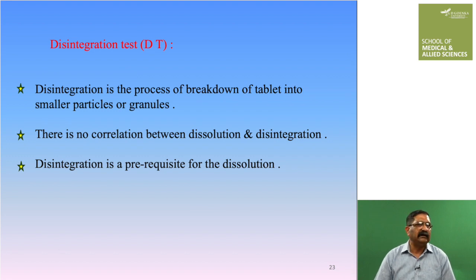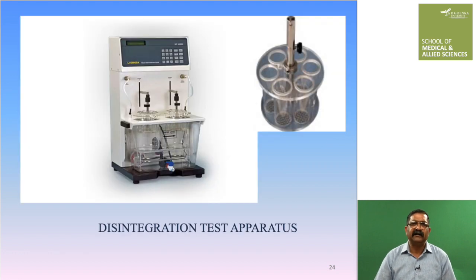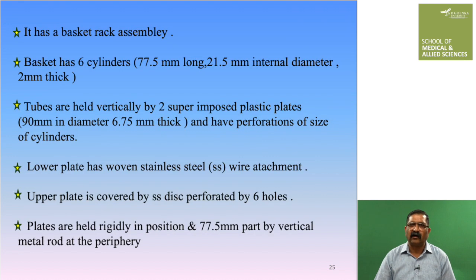First of all, it is the process of breakdown of the tablet into smaller particles or granules. There is no correlation between dissolution and disintegration. Disintegration is a prerequisite for dissolution, which you can see in the image. The disintegration test apparatus is shown in the slide. Let us talk more about the disintegration test apparatus.